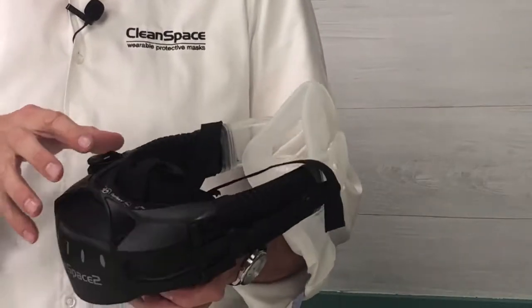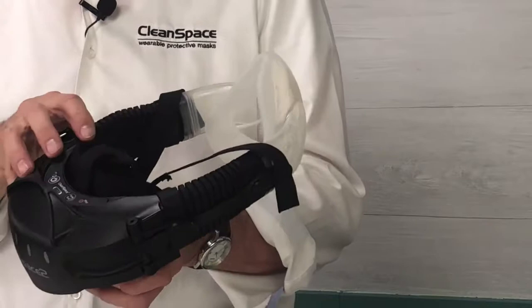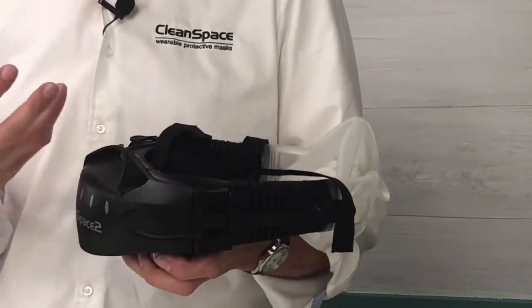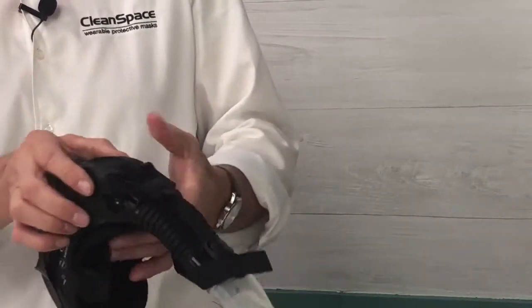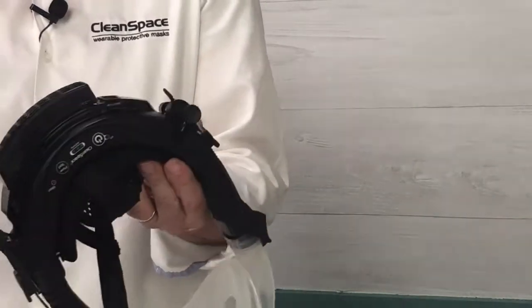I'd like to start by talking about the filter system and the motor unit that comes with CleanSpace. When we look at CleanSpace, the simplest thing is if we start at the back, and at the rear of CleanSpace we have the filter. This is the filter cover. We have a clip which we pull up to reveal the filter. Now this is our low profile filter. This is a P100 high efficiency filter.